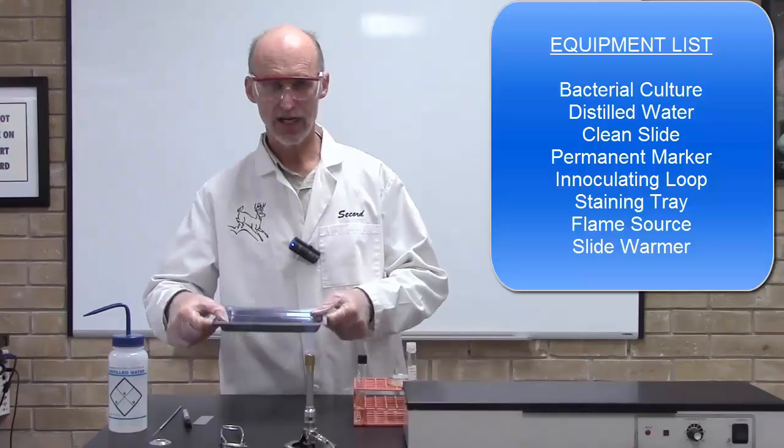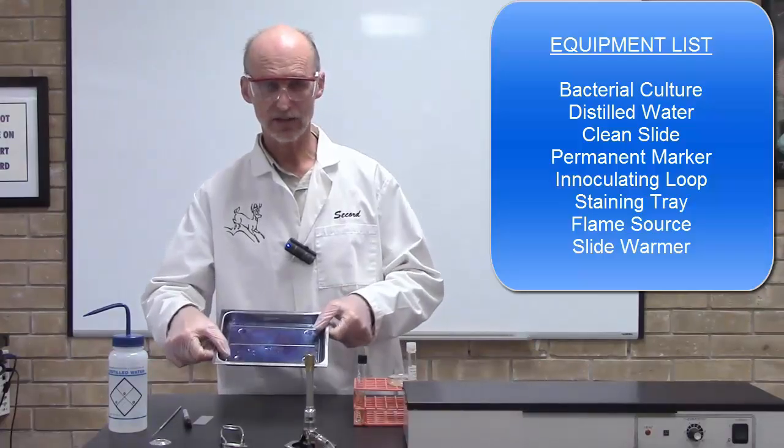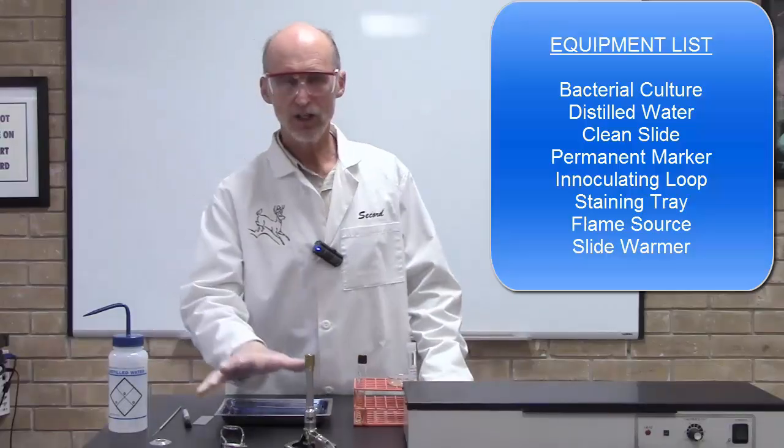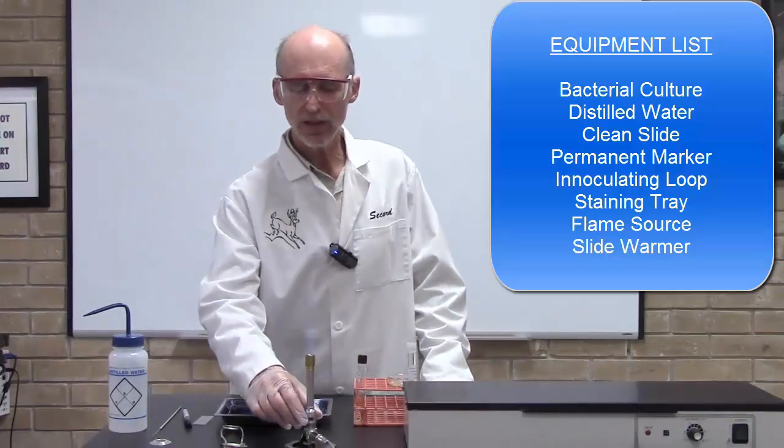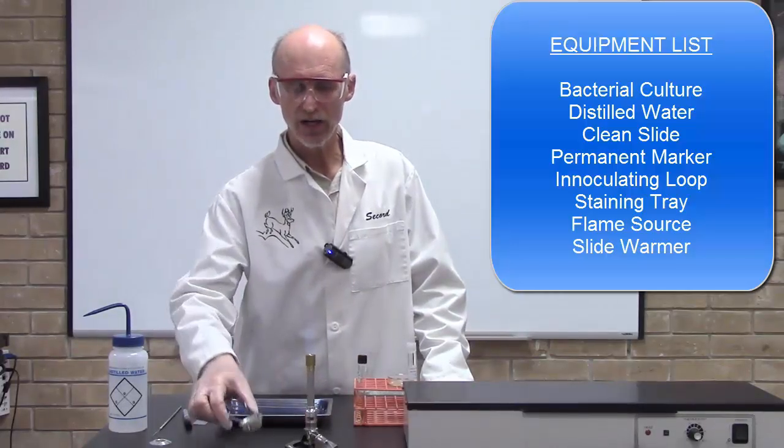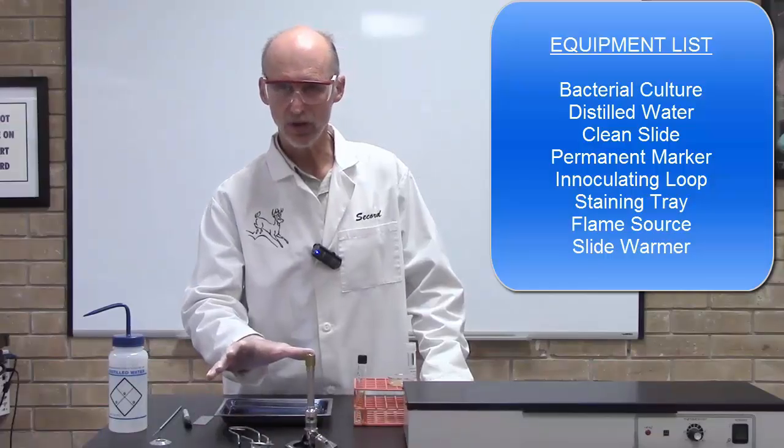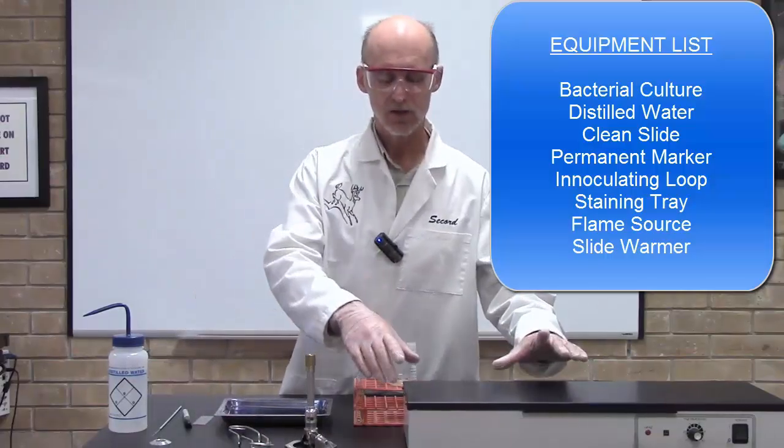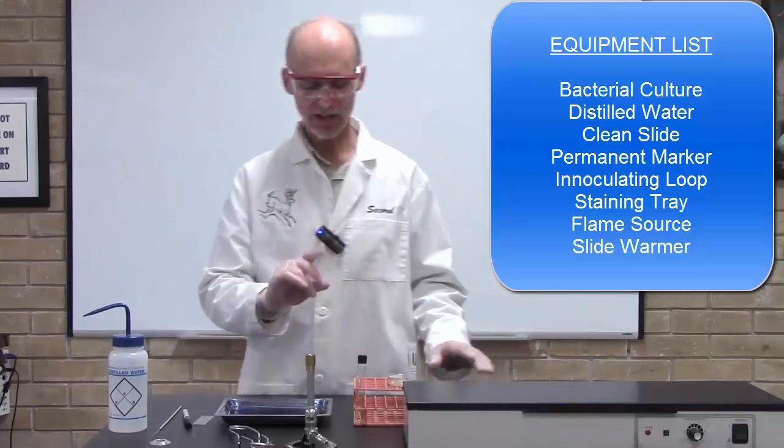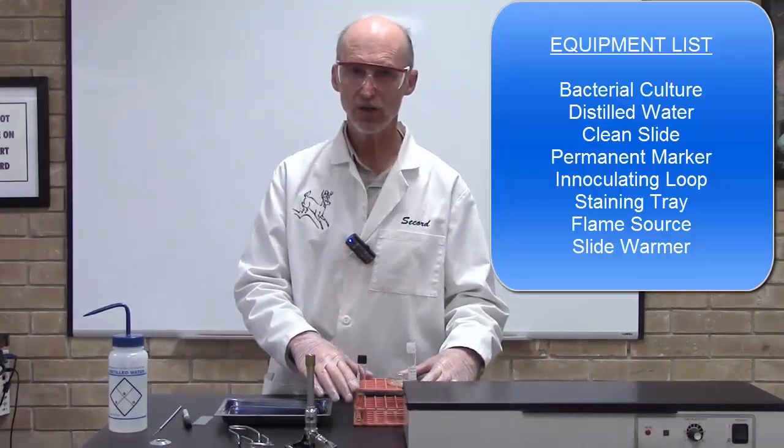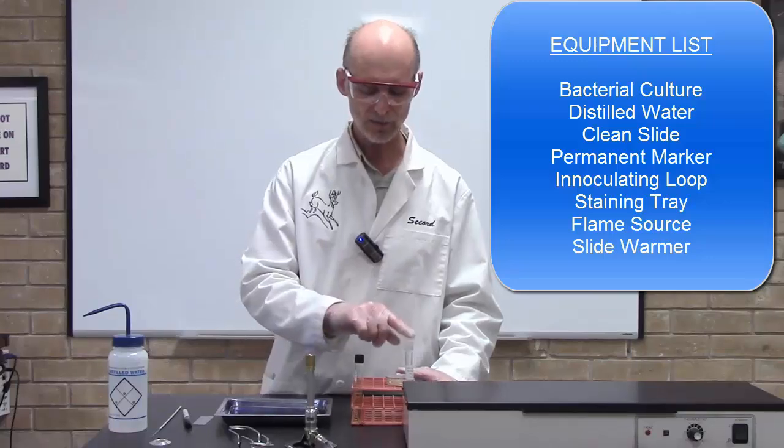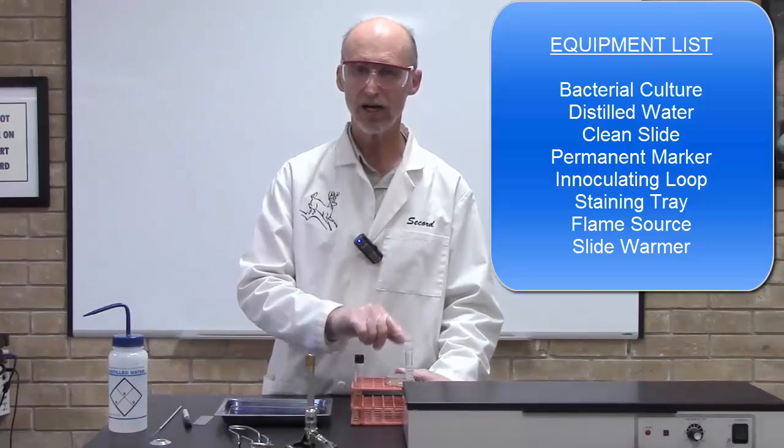You'll need a staining tray to act like a workbench for you. You'll need a flame source. I'm using a Bunsen burner so I have my little flint striker, but any flame source will work. You'll need a slide warmer, and finally you'll need a bacterial culture. Here I have three different bacterial cultures which I will talk about in a second.